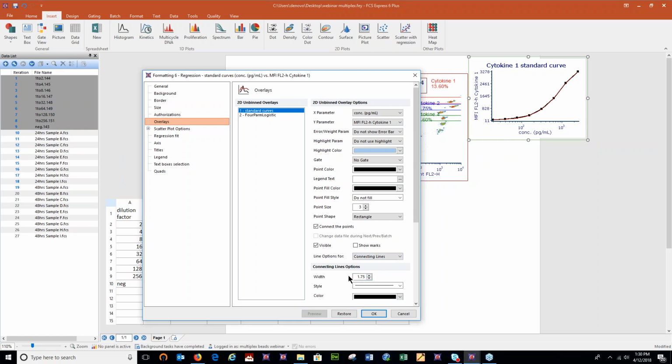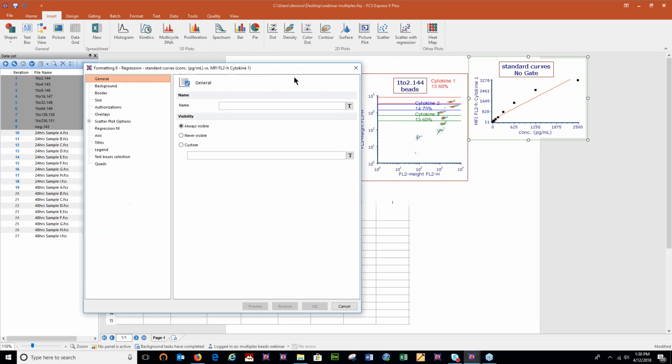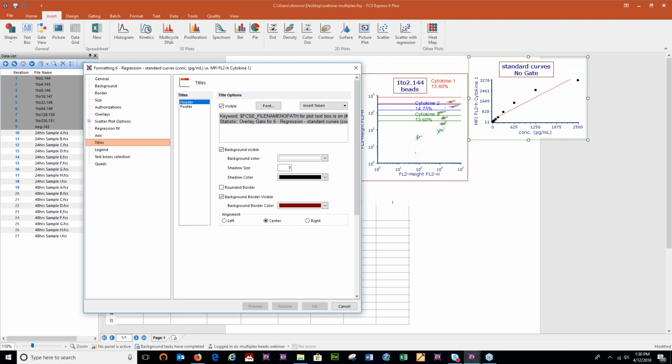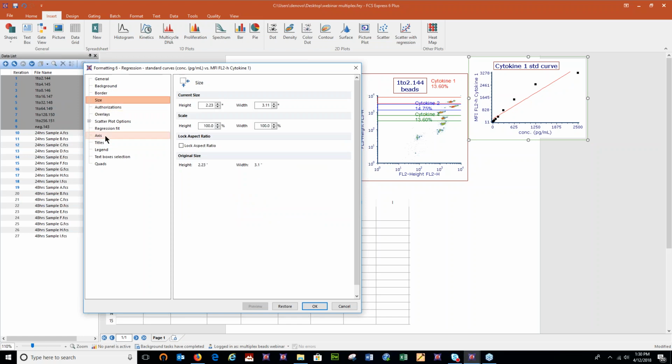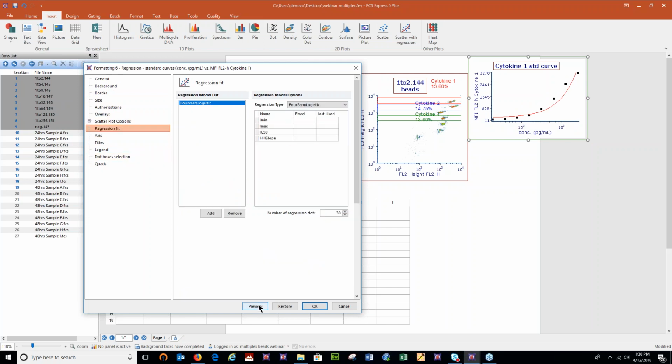Oops. I think I did something different there. Hang on. Oh, yeah. Okay, sorry. Let's come back in real quick and alrighty, and for parameter, I apologize.